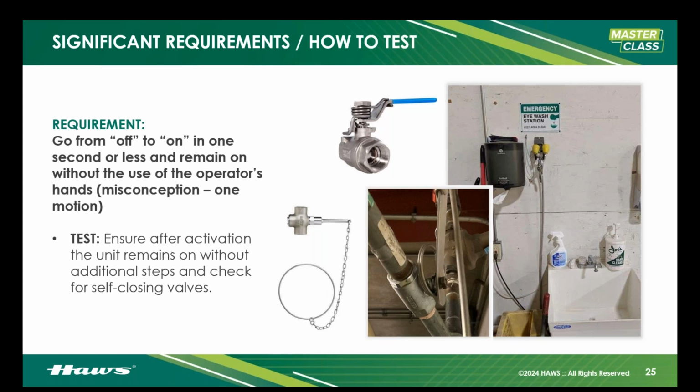The other one is sneakier. In your facilities, watch out for the example on the far right, okay? The valve itself is non-compliant. It's not a stay open valve, but that's not what I'm getting at. The eyewash heads themselves are pointed at the wall. Now, say that was a stay open valve and I pressed it. I can't just let that go and easily use it without my hands on the device. I have to grab that, hold it, and point it at my face. That's non-compliant, okay?